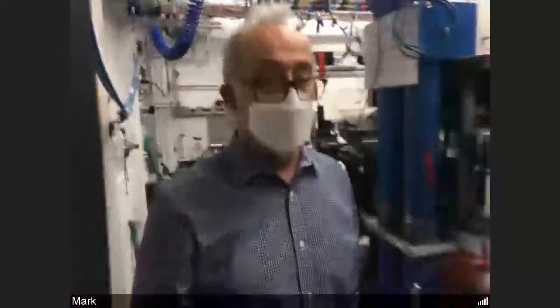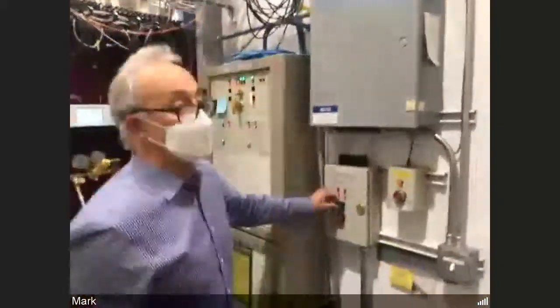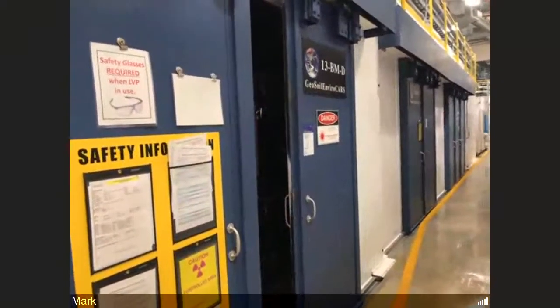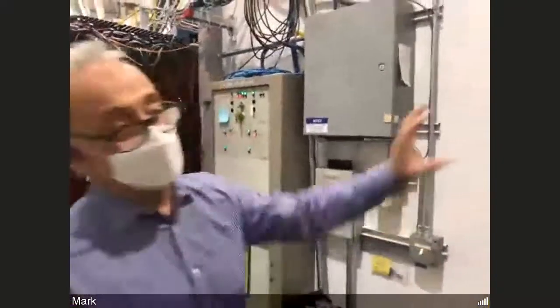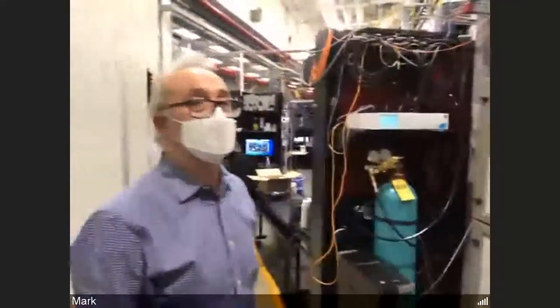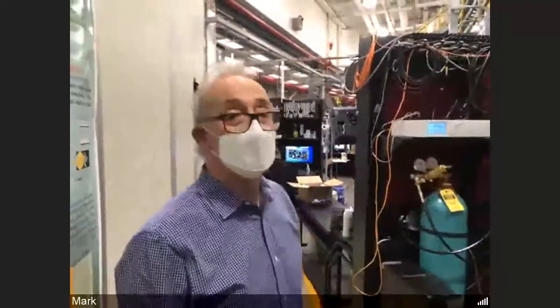And then we're going to both leave. Right, and I'm going to go over here and turn out the room light, and close the door. This button is a dead man. I have to keep my finger on it. And there's a warning tone telling everybody to get out of there, and they have about 60 seconds to exit or hit the emergency stop button if anybody were caught in there.